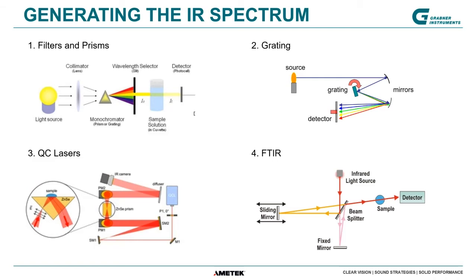So how is infrared spectroscopy working? There are basically 4 techniques which you can apply to disperse the radiation or the energy to see which characteristic energy was absorbed by the components which I've mentioned before. And each technique has unique advantages and limitations. The first and most simple technique are prisms. It's also the cheapest way, filters and prisms.